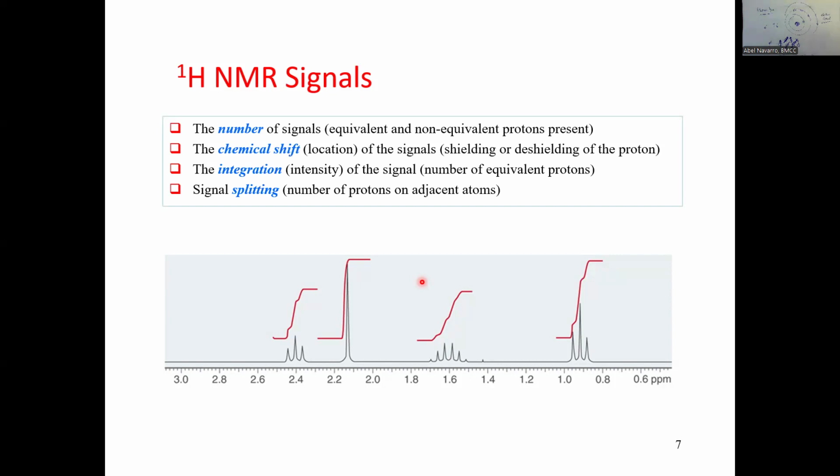And then the NMR spectrum, you have it in front of you. This one is an NMR spectrum, and you see 4 things. The number of signals. Why do I have 4 signals? 1, 2, 3, 4. I see 4 signals. If you see 4 signals, that means that you have 4 types of hydrogens. Okay, so how do I know the number of types of hydrogen?